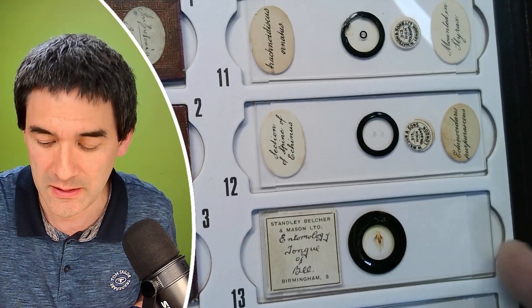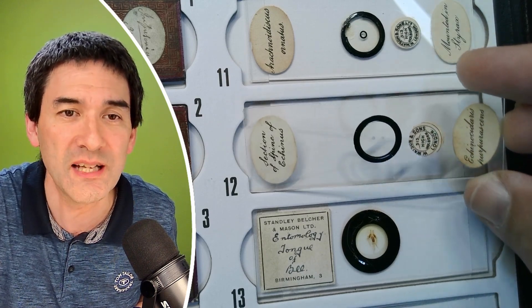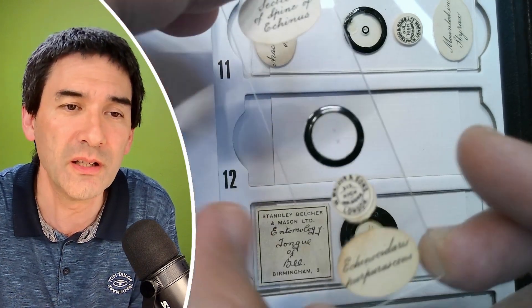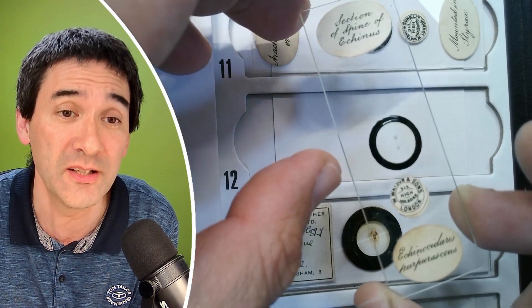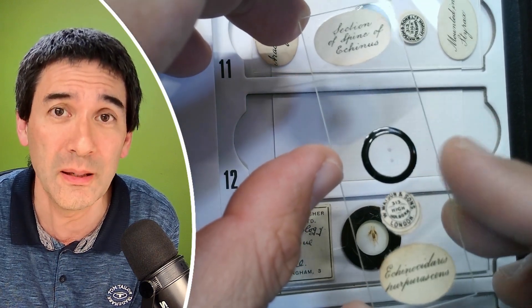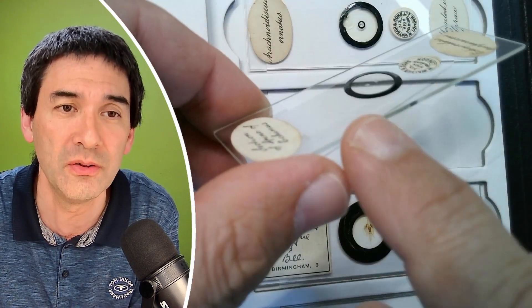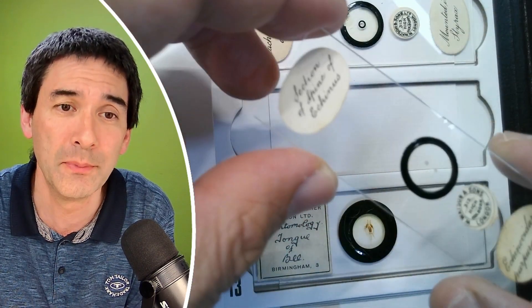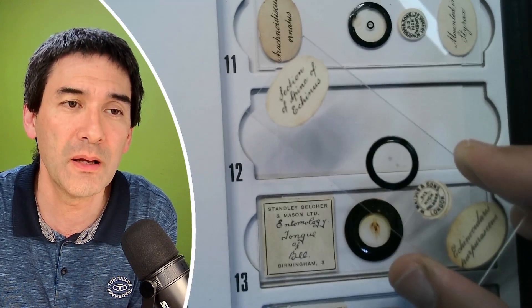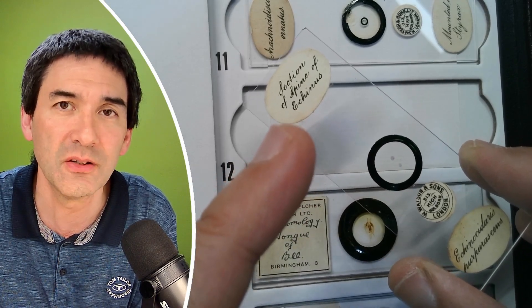These are actually one of my favorite ones over here. These are the cross-sections of the spine of a sea urchin. You always want to only touch the slide at the side. Let's just put this under the microscope simply to show you the enormously high quality of the slide. It's not only that the sample was properly prepared and embedded and ringed, but also the slide itself — the glass itself is of quite high quality. You can tell because the edges are actually sanded and quite smooth. There are basically spines of echinus — the cross-section of the spine.